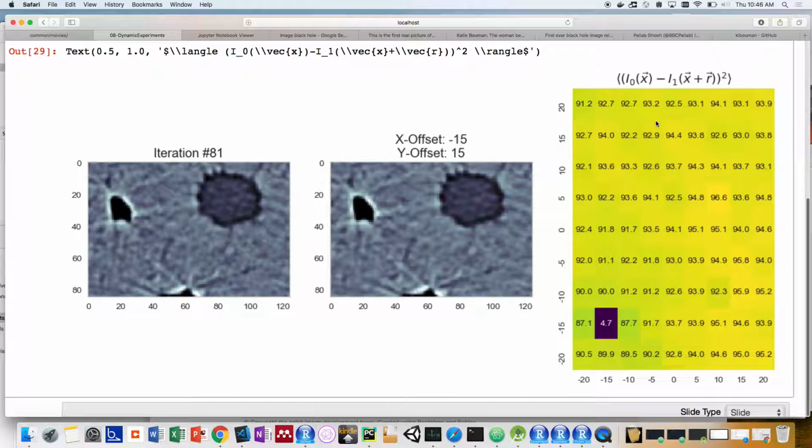Yeah. So now those two images are fairly similar. What if they differ more? Which method performs better in that case, like the mean squared error or the correlation-based method? So it depends a lot on how they differ. Say you have a different intensity scaling, or if it moves out of focus or something like that.